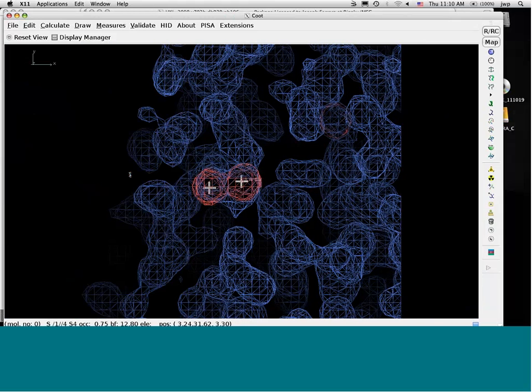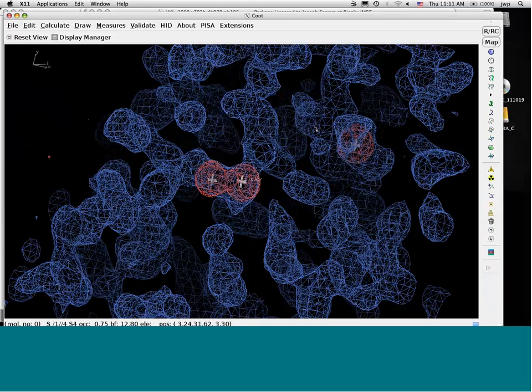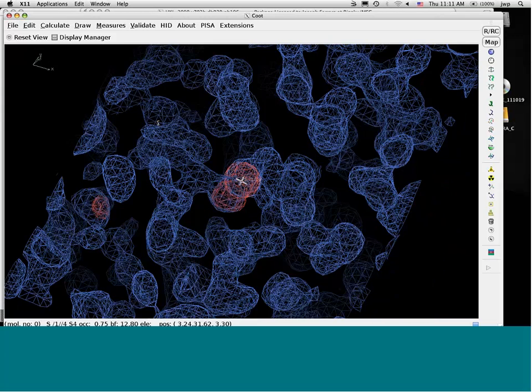Okay, so if you collect fast, though, and with high redundancy, more things can go wrong, I personally think. I'd rather get the data that I know can do the phasing as quick as I can. And speaking to that, too, I know of examples in our lab where we've cut back some of the data, and long data collections have been more successful than using all the data where you might have damage.